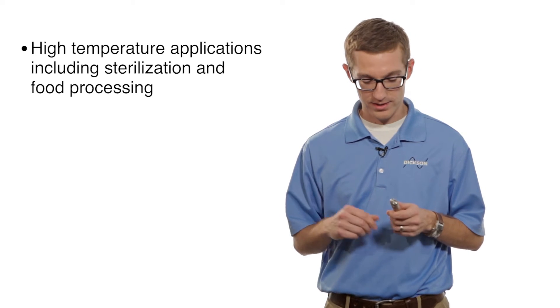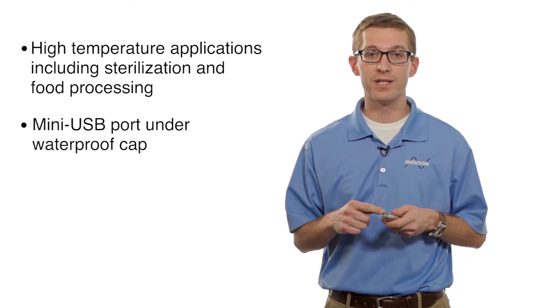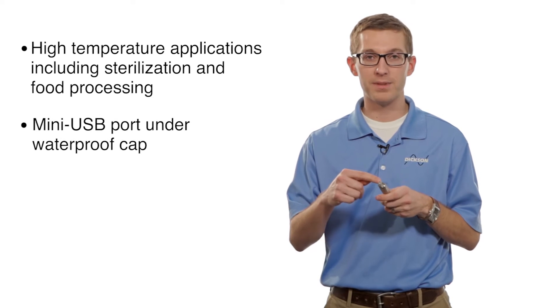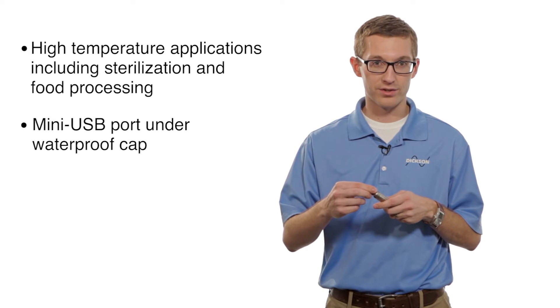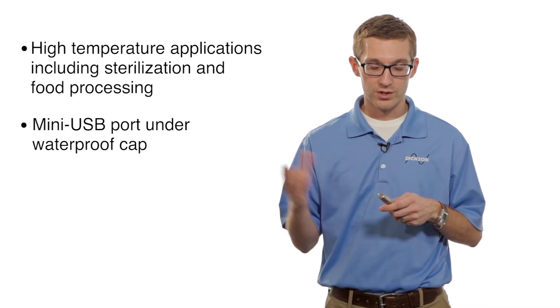A couple of the cool features on this is that it downloads with a USB connection. Right underneath the cap here is a mini USB port. You just plug it into your computer and you can get all the information directly downloaded.